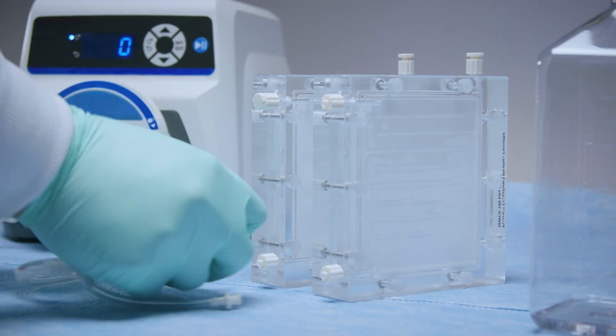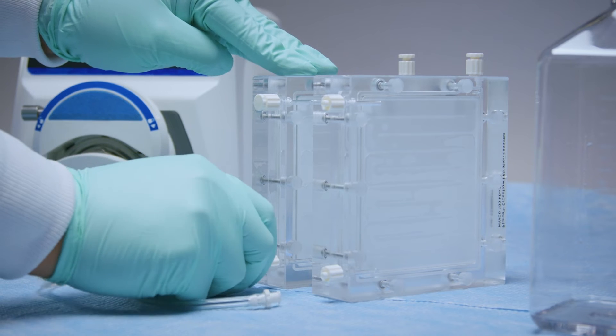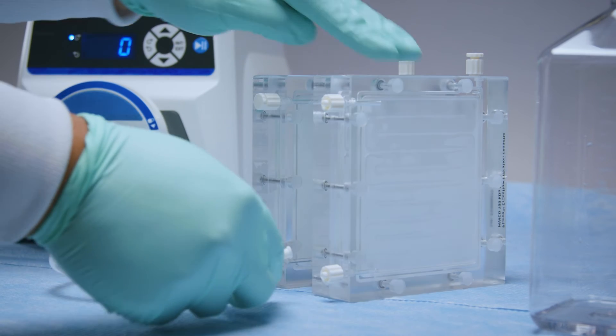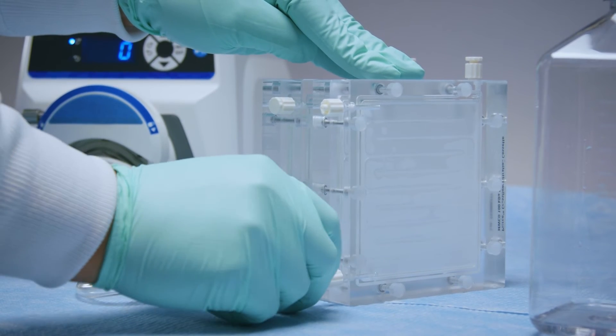Two cassettes can also be connected in parallel to concentrate up to 6 liters of sample volume 20-fold in under 80 minutes.